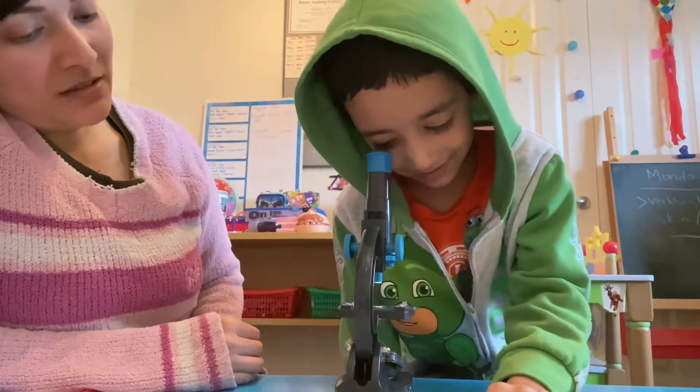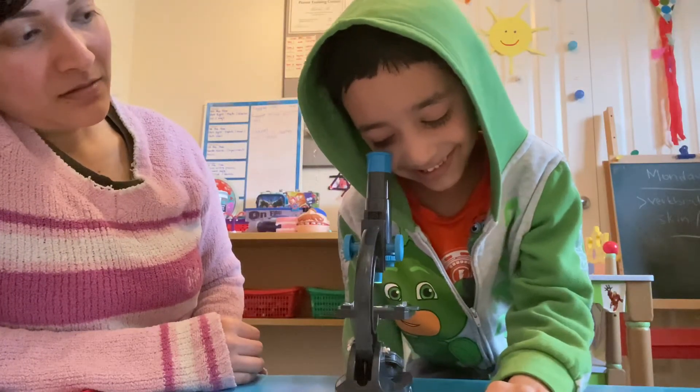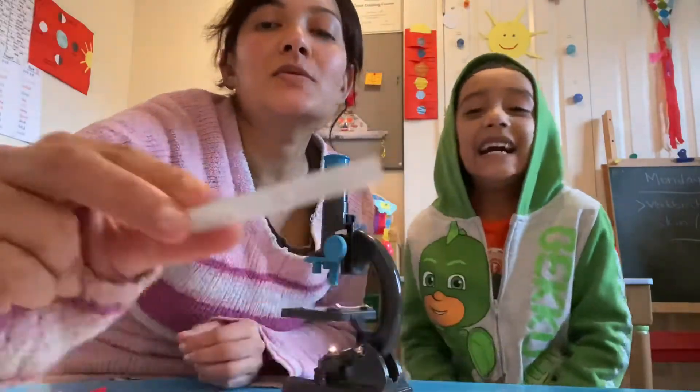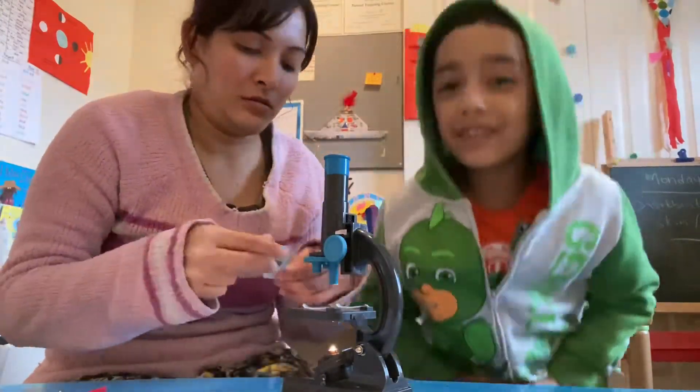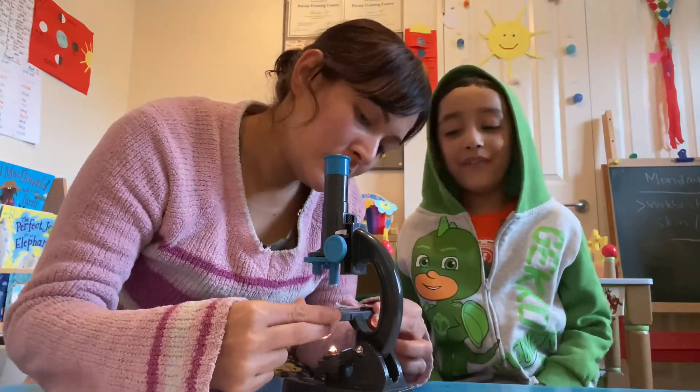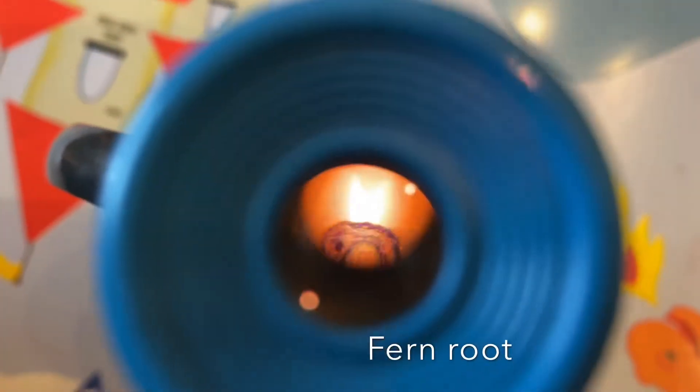What can you see? Little sticks! The next one we're going to look at is the fern root — let's see the fern root. So guys, if you can see — pretty good!